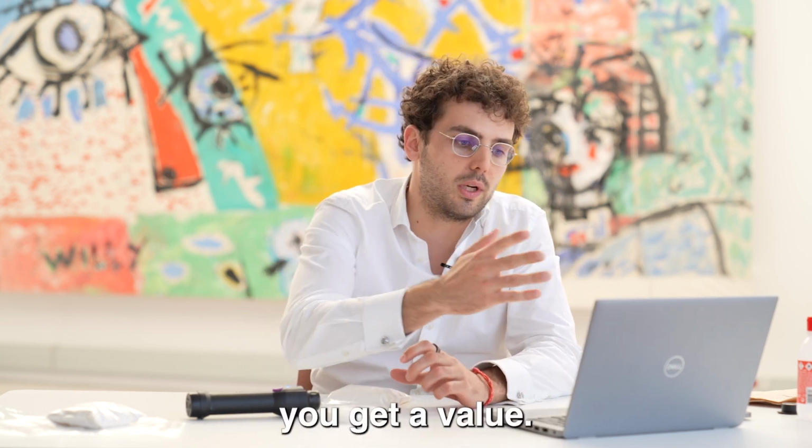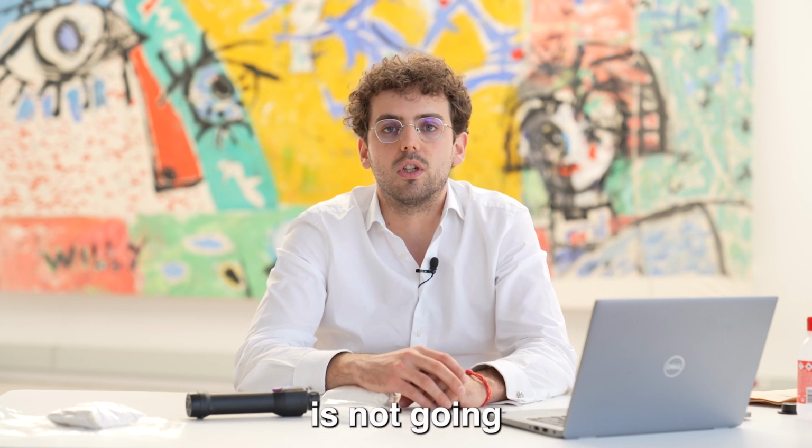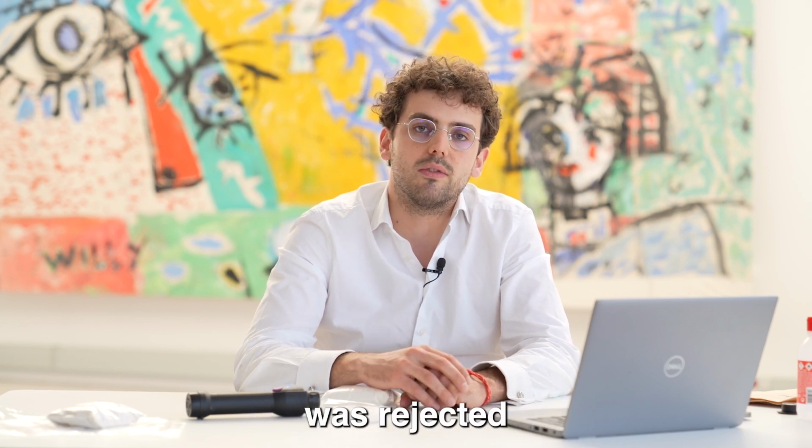So after a few seconds, you get a value. In this case, of course, I know this sample is not going to be good, and so this sample was rejected from the Blendhub production.